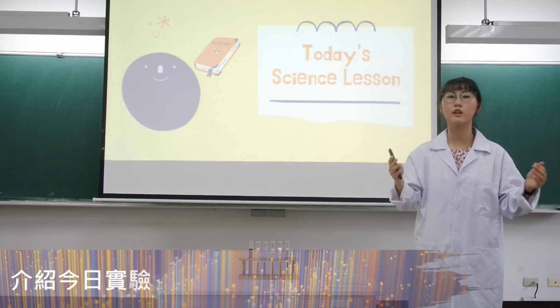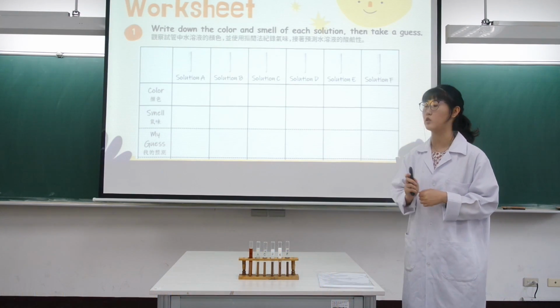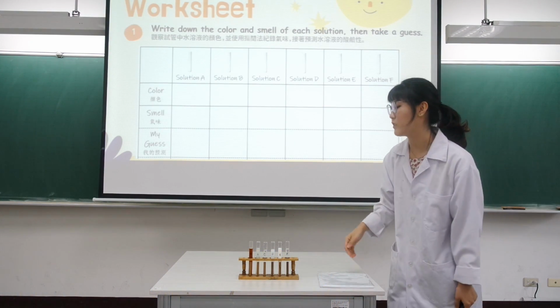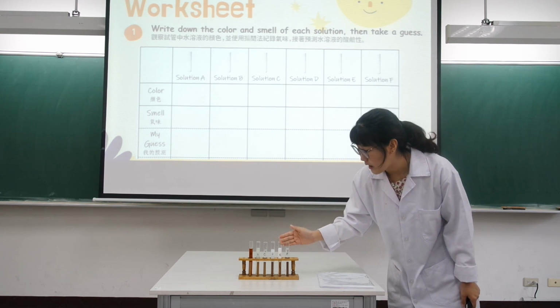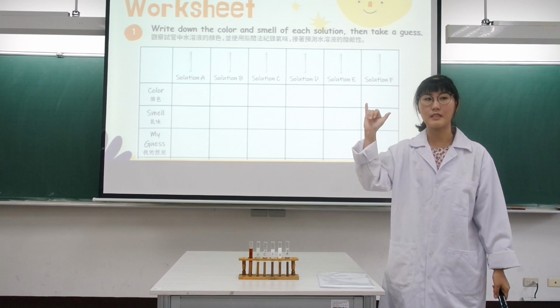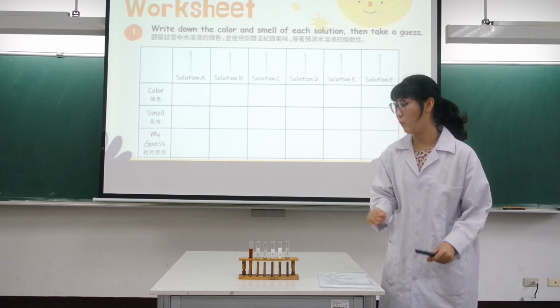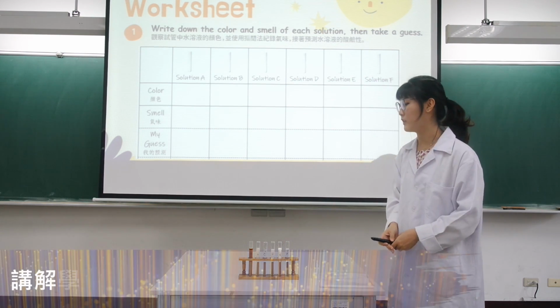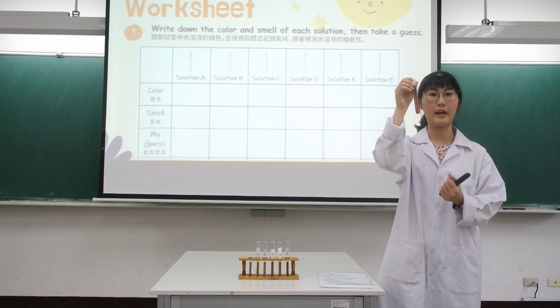So today we're going to do another experiment. 今天要再做另一个实验哦。So we have solution A, B, C, D, E, and F. 6 different kinds of solution. I don't know what they are. I want you to take the solution. Like this is solution A.